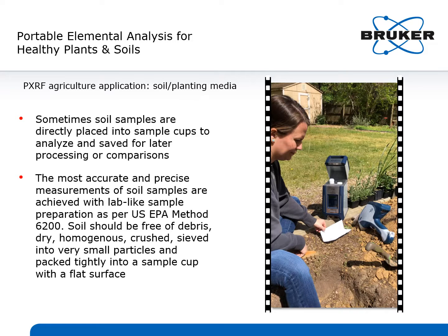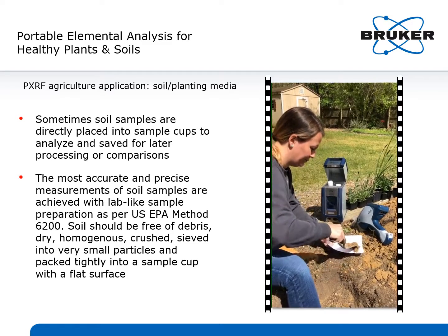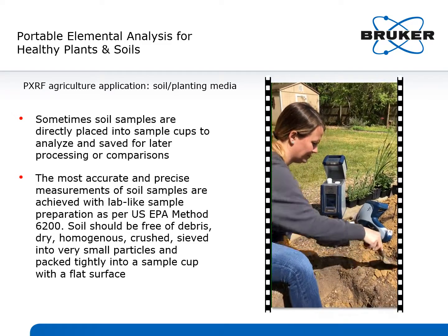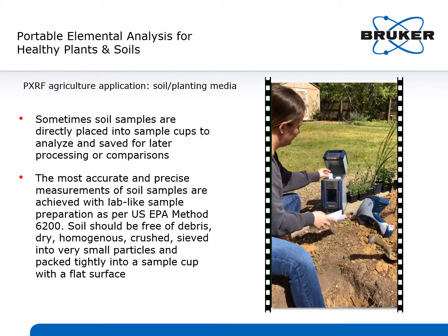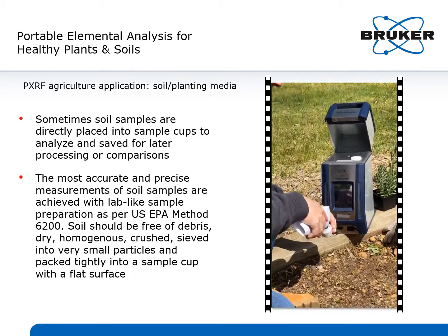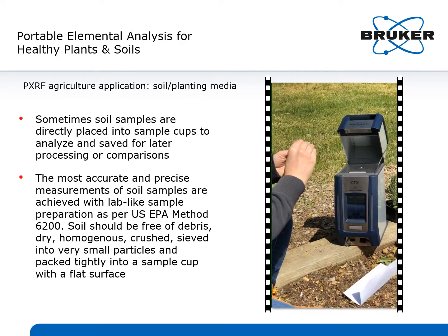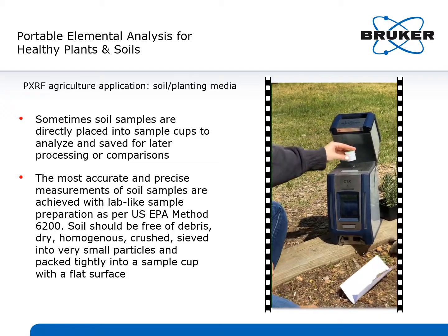However, lab-like sample prep should be used to obtain the most accurate and precise measurement of soil samples. They should be dry, homogeneous, crushed into small particles, sieved, and packed tightly into a sample cup with a flat surface, following methods like US EPA 6200.